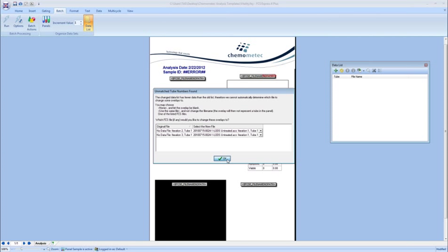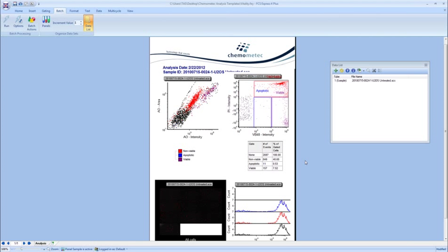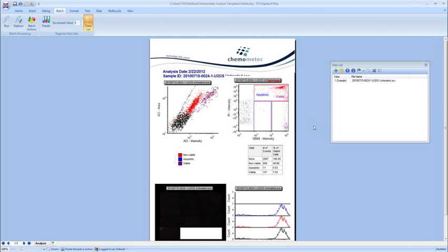And what's going to happen here is that as this data loads, and we're going to load up the image, all of these things are going to fill automatically, and your sample is ready to run the batch process or export to PowerPoint or to PDF.